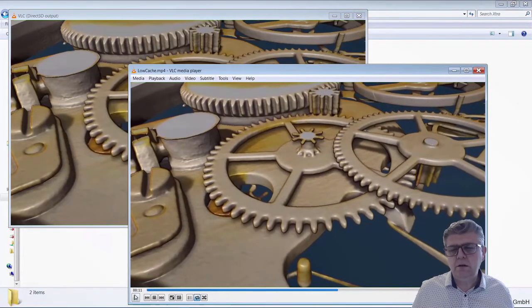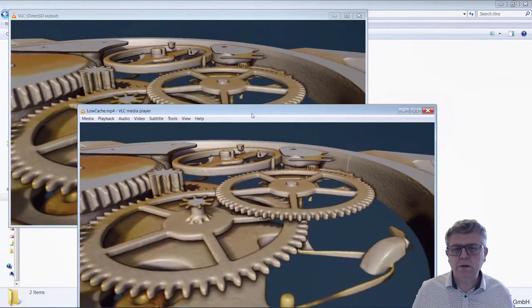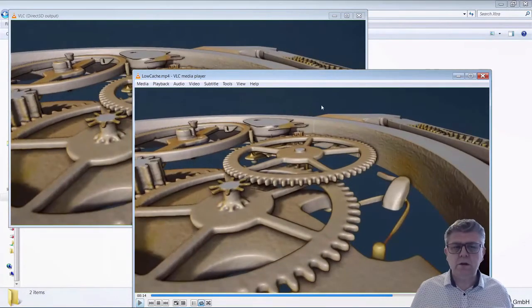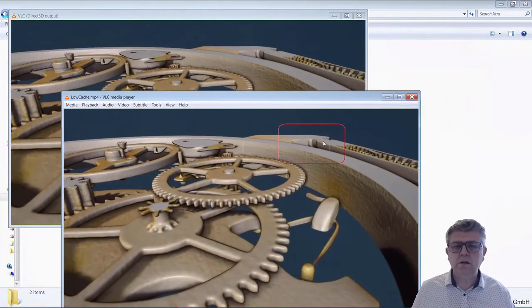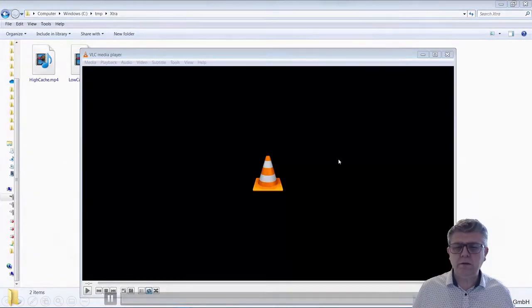So as expected, with the 2 different configurations, you have artifacts, especially when the camera moves around, zooms in, zooms out, or the viewpoint changes, because the data that was out of the view is loaded at lower resolution, and the area that is in the view is higher resolution. Of course, if you have a lot of memory, this is less evident.